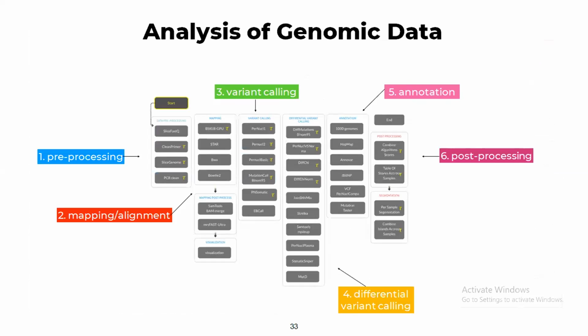We will analyze genomic data using the T-bioinfo platform, at the mutational level, where you will perform pre-processing steps. You will learn how to generate mutations and what different methods are available to pre-process these data.